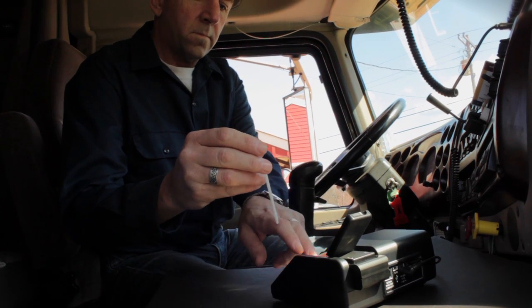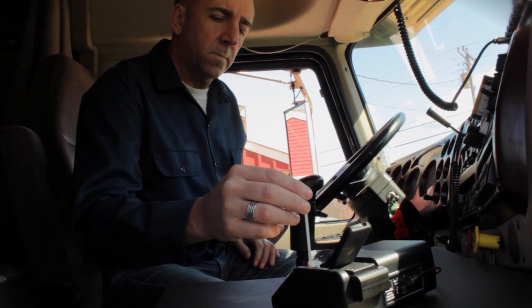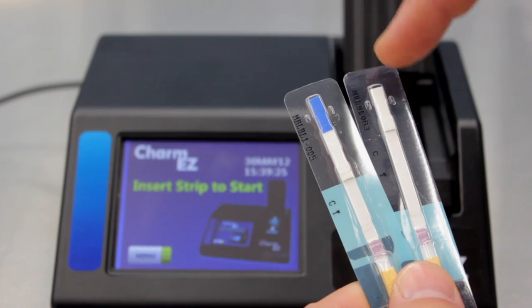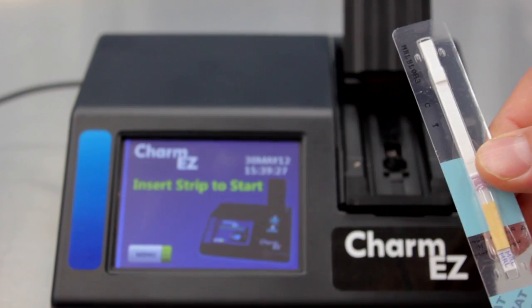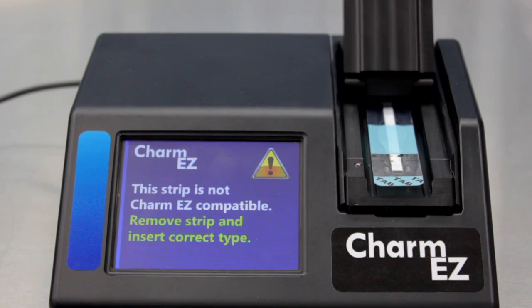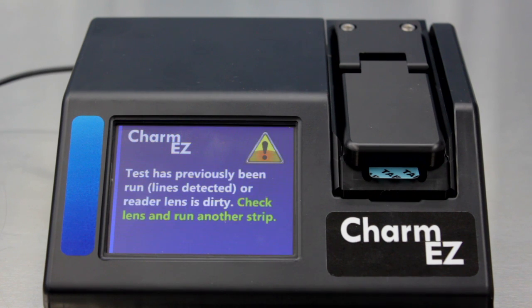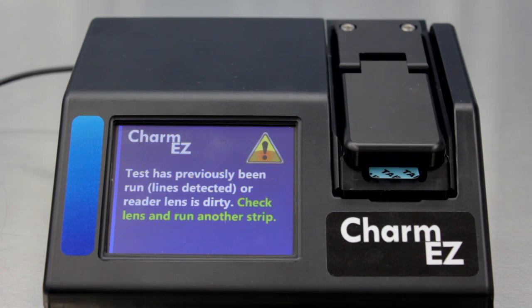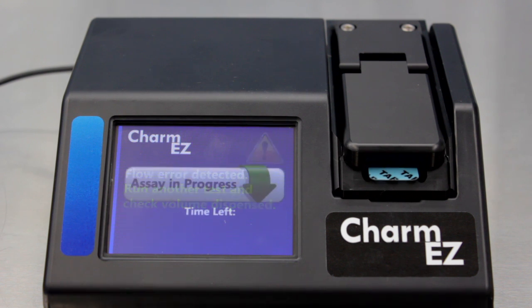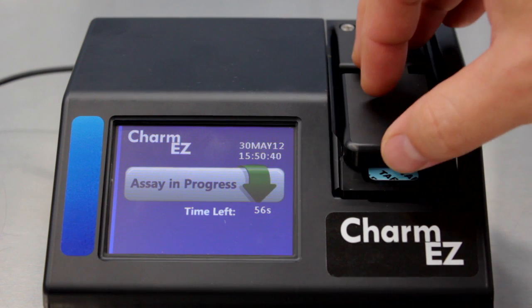The Charm EZ is protected against operator error. The system will automatically alert the operator for the following errors: if the operator inserts a strip that is not Charm EZ compatible; if the reader lens is dirty; if the operator inserts a strip that has been previously run; if the operator adds too much or too little milk; or if the operator removes a strip before the test is completed.